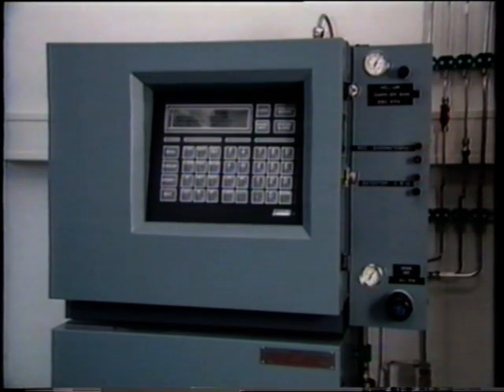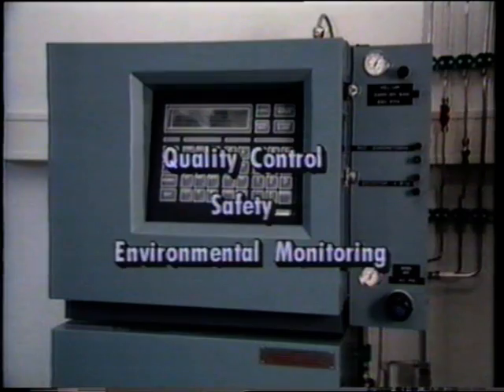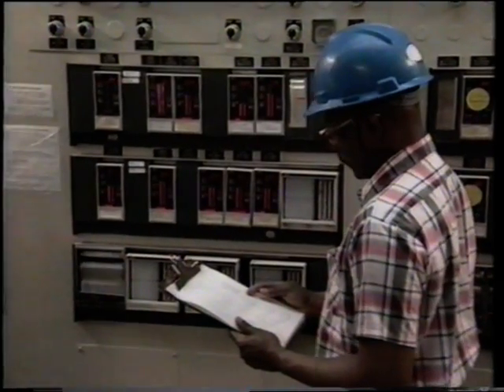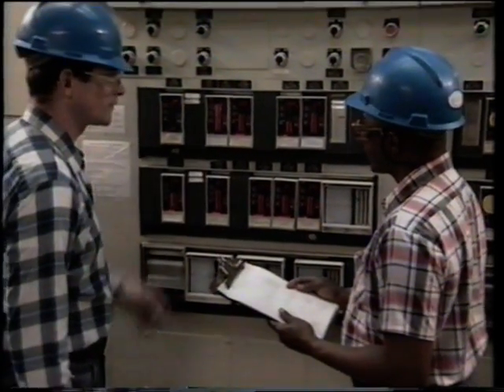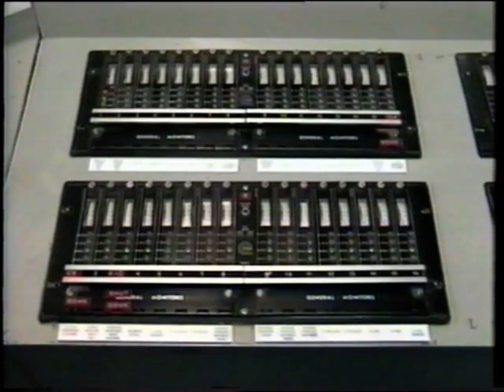Three important applications of process analysis are quality control, safety, and environmental monitoring. Analyzers help ensure that intermediate and final products meet specifications. Information provided by analyzers is used in the process control system to help stabilize industrial processes, thus preventing dangerous accidents. Analyzers can also provide early warning of hazardous situations so that corrective measures can be taken.